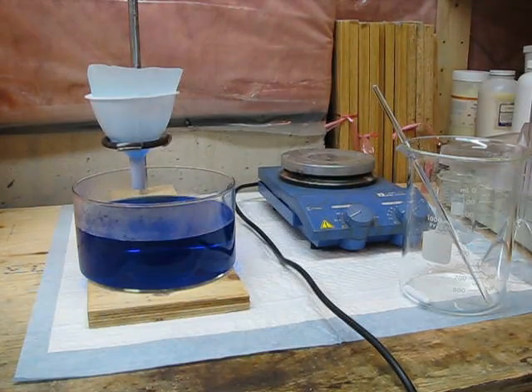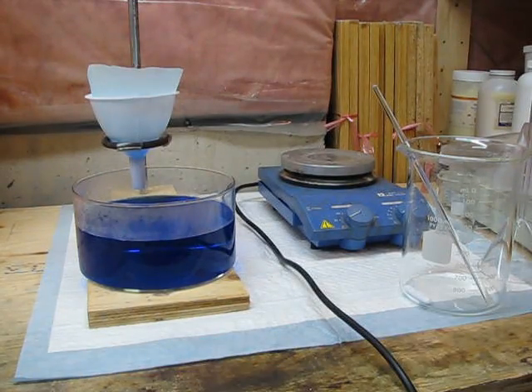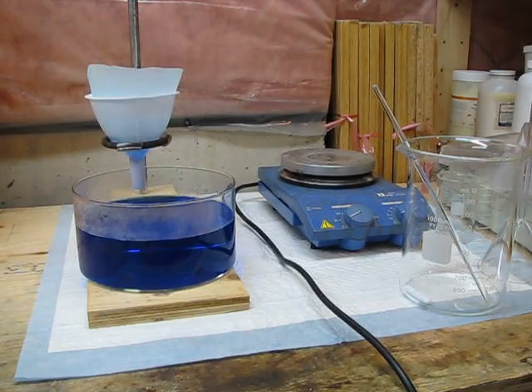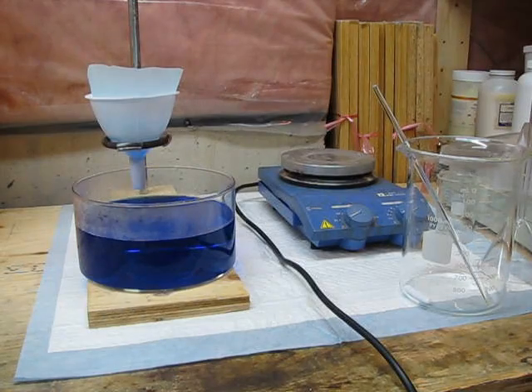You've seen in previous videos how I've had a large amount of paper towels laid out underneath the workspace to catch any spills and prevent chemicals from soaking into my wood workbench here.